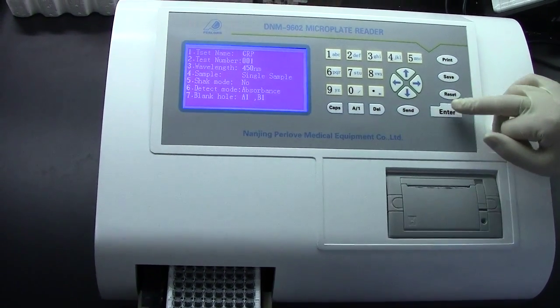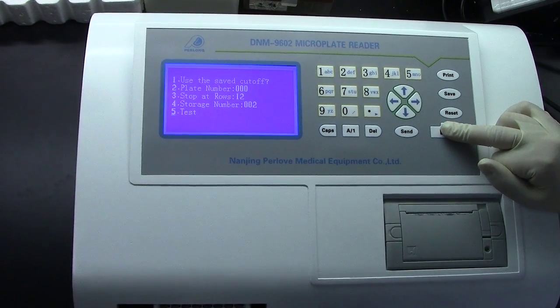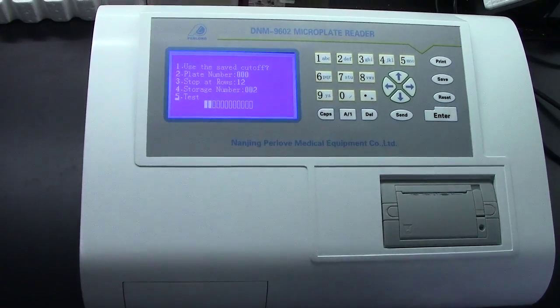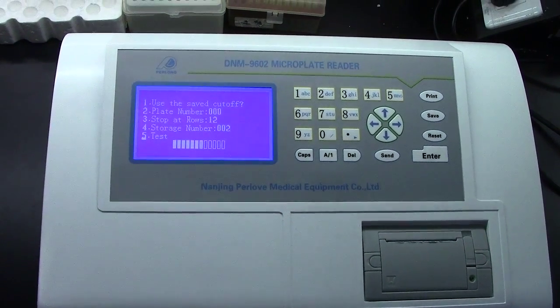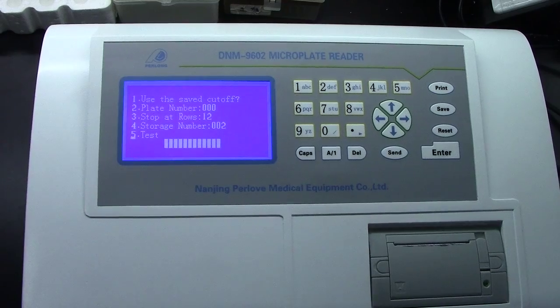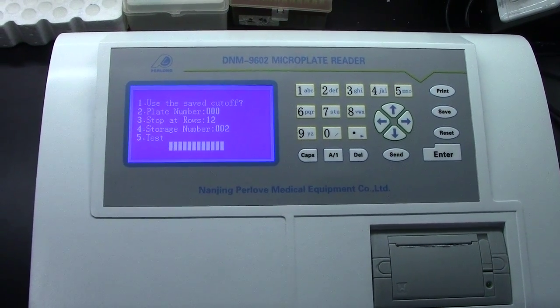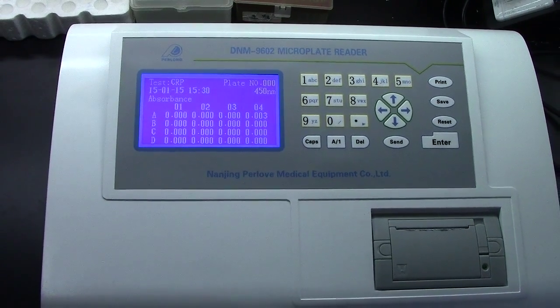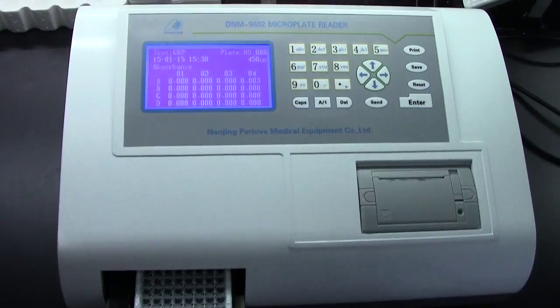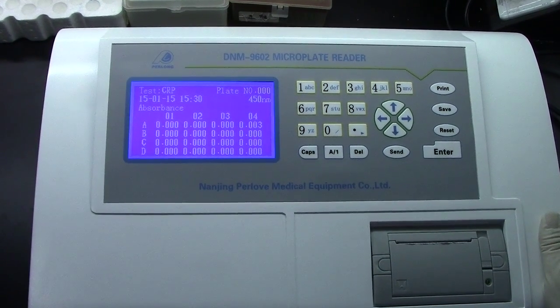Press ENT. This is the details for the CRP. Now it's detecting. We get the result. Because there is no sample, the results are zero.